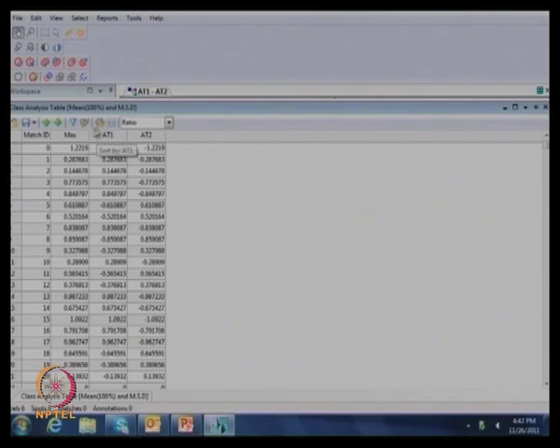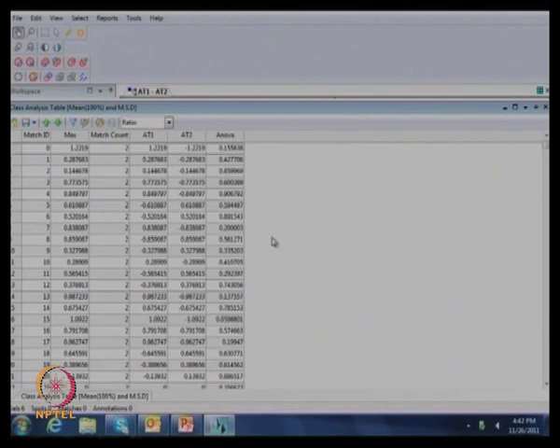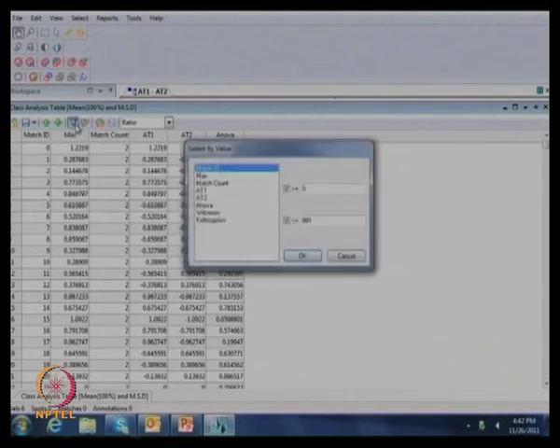Now this is the statistical parameter, so there are various software that give you options for doing different types of statistical analysis. Exactly. So this is the ANOVA value which we can see. On the basis of this ANOVA value, we can easily select our protein of interest, and you have the fold regulation also. This is 1 fold upregulated and this is 1.2 fold downregulated. The same way you can see the whole values. Now no need to go to each and every individual spot. You can filter them easily.